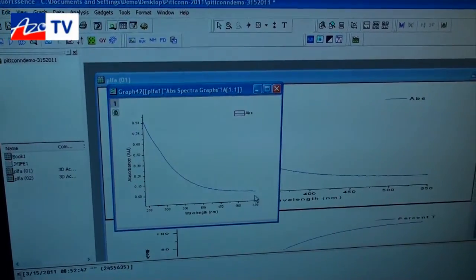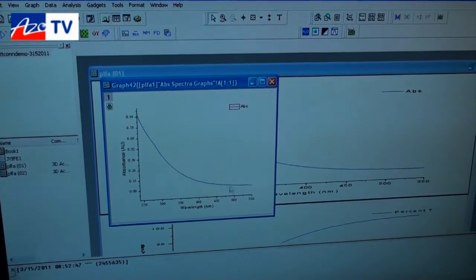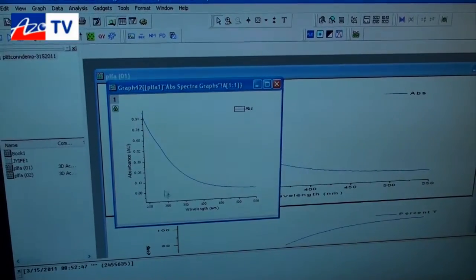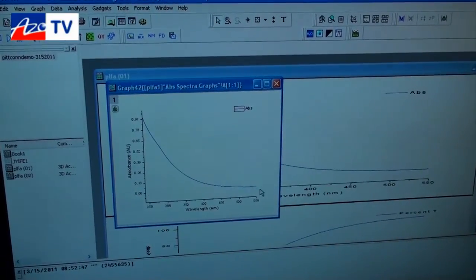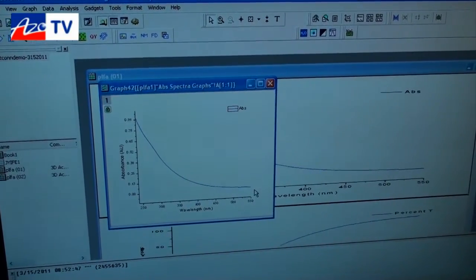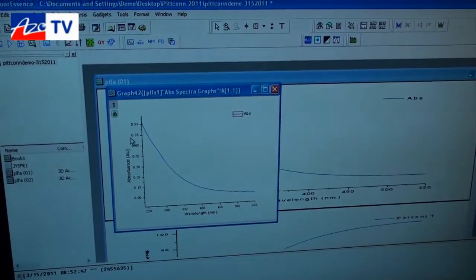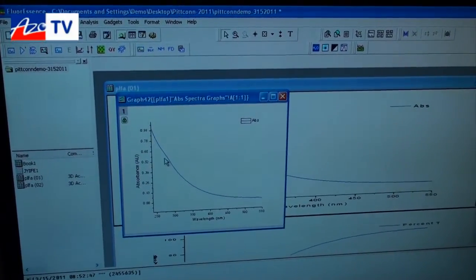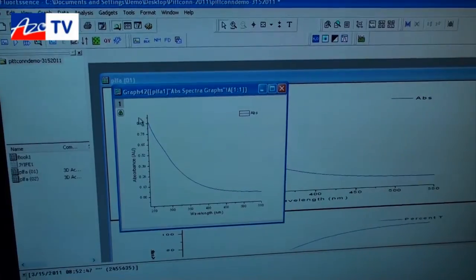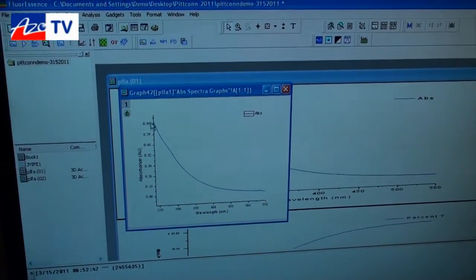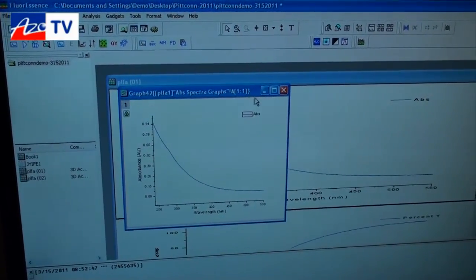One key thing about the instrument design is that it actually scans the excitation and absorption wavelength in reverse, and this minimizes the exposure of the sample to the ultraviolet end of the spectrum. So as you scan in reverse you actually end up avoiding exposure to the UV light which can photo bleach the sample.